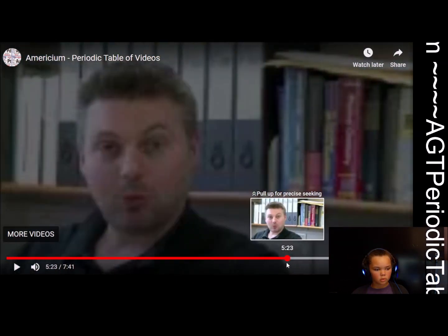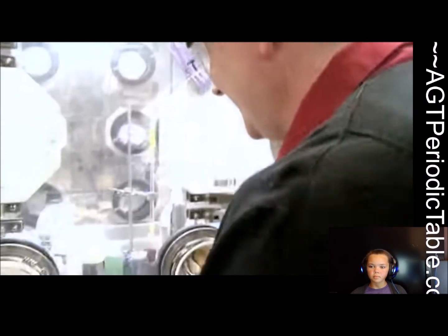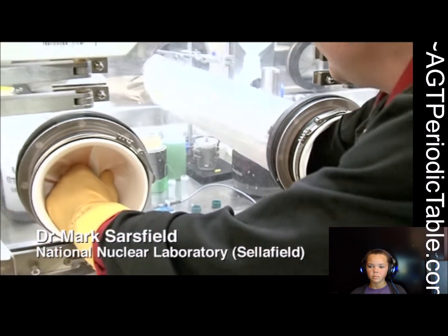That is not what I'm meant to do. Americium is really a very radioactive element, so it is handled in this glove box, and I'm not qualified to use such equipment, so Mark, who works here, will tell us about it.